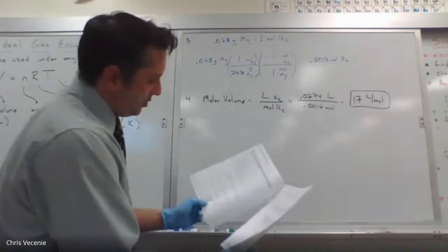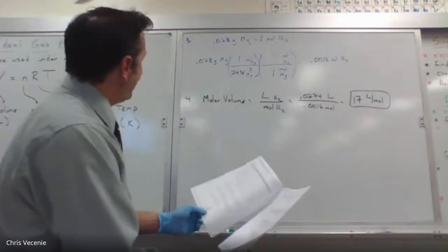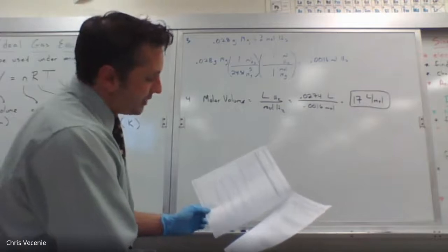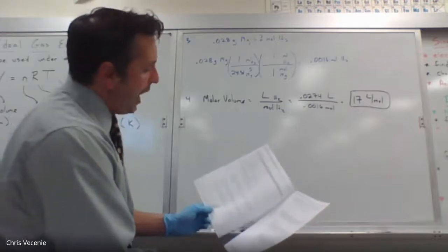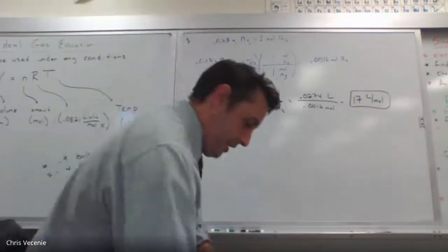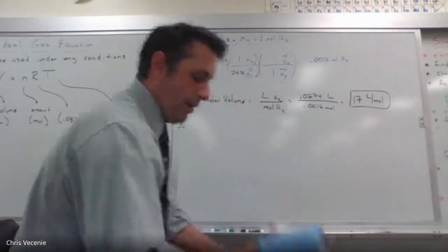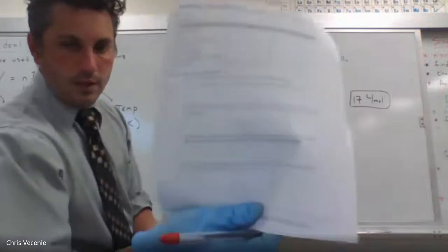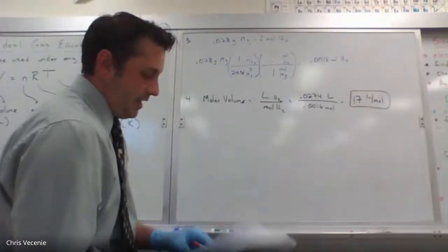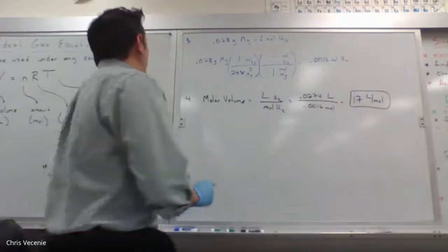All right, now I'll just have you guys do one trial for the experiment. If we want to do that, that is going to be a lot like number 3 of the pre-lab. So next to number 1 in your post-lab, I would go ahead and write pre-lab number 3, because that is what you want to follow to get that.